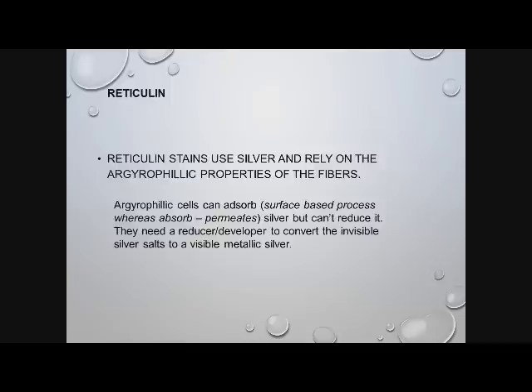Okay, how many people know what argyrophilic cells are? Well, I can see your hands. That's great. Argyrophilic cells cannot absorb solution. It can't permeate it. So what happens is with our argyrophilic cells, things can cling to the surface. So it's all a surface-based process.